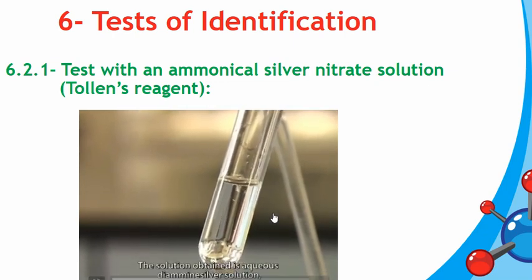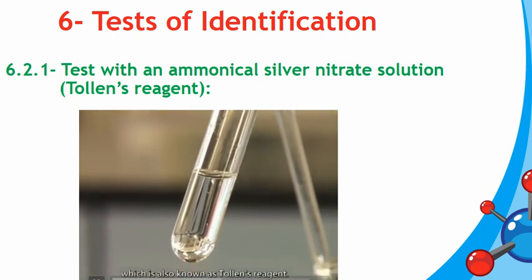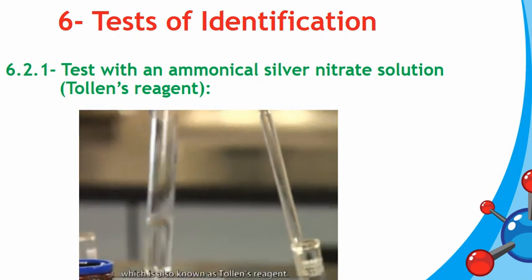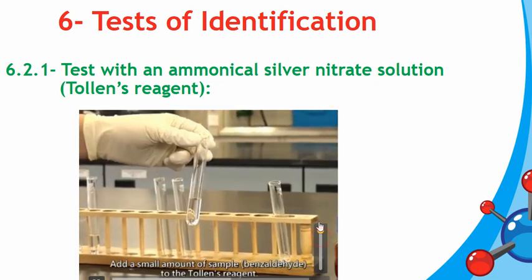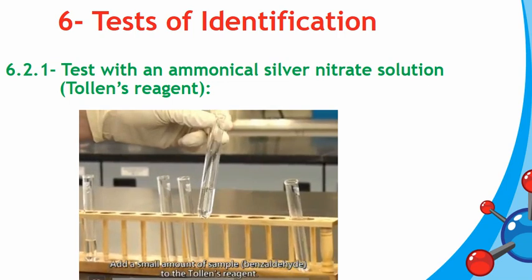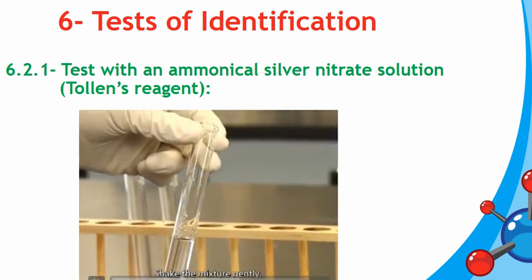This is the Tollen reagent, freshly prepared. We add the colorless liquid organic compound.